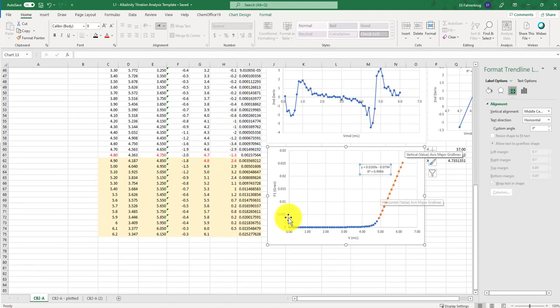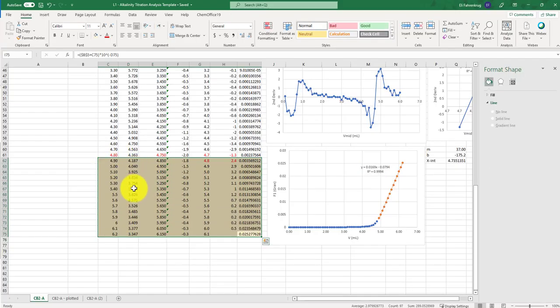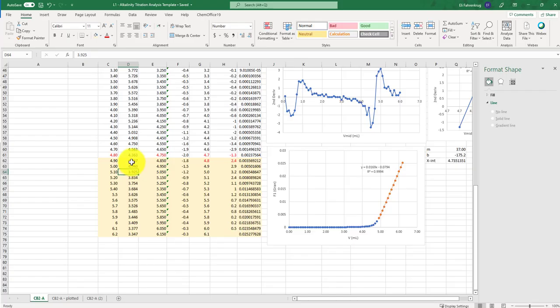And that's important if we look at where we are in titration space, look at these volumes, or look at these pHs. The equivalence point was, by eyeball, roughly at a pH of 4.3. And so that means you could have stopped your titration there if these were your estimates, or if these were the way that you were going to determine equivalence volume.